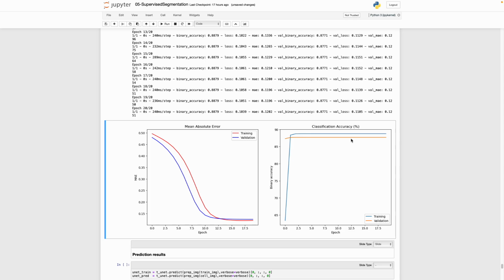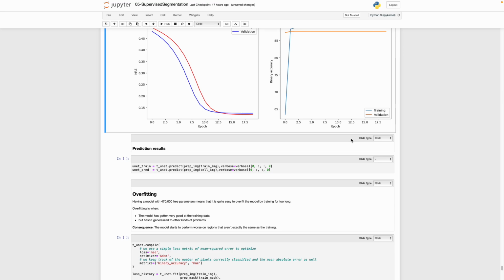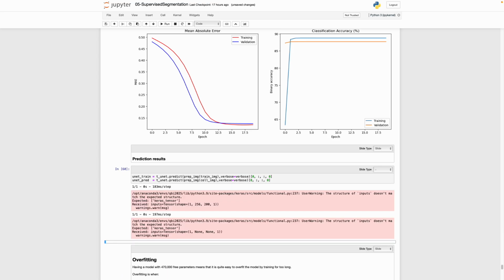Now you have to keep in mind that the data we have is just a single image. So we don't train on a lot of data, and these are data-hungry methods. So you really would like to have 1,000 images of that kind in order to train well. But then we are not in the scope of what I can do during this lecture. And not on my laptop. So, let's try what it does now.